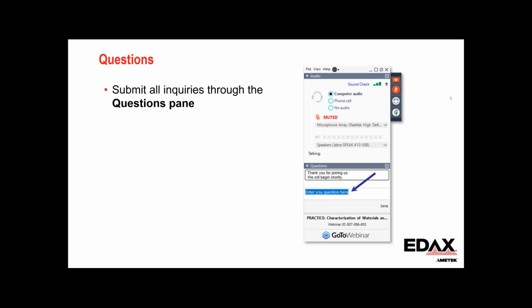I usually don't see a huge improvement in precision, and there are two reasons for that. One is that tweaking the Hough to get the best band detection is a little trickier as the number of pixels goes up. We typically bin the pattern down to 100 by 100 pixels for performance, and when we go to higher ones, I don't necessarily think we find the lines better, and also there's the way that our standard triplet indexing works.